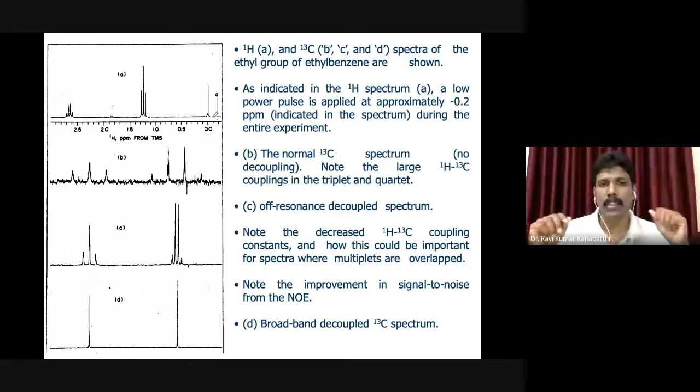We are measuring the nuclear magnetic resonance spectroscopy, right? So even though we are speaking about the delta ppm, 1 ppm, 2 ppm, this x scale is in fact a frequency scale, right? Okay, we normalized with the resonating frequency of the operating spectrometer. That's how it becomes the ppm scale. But it is a frequency, right?